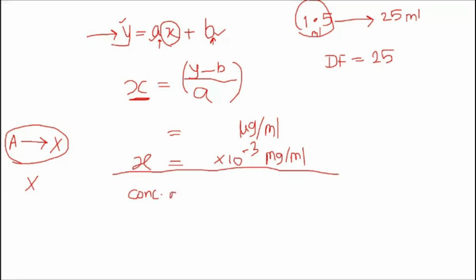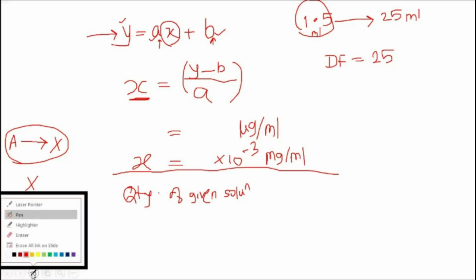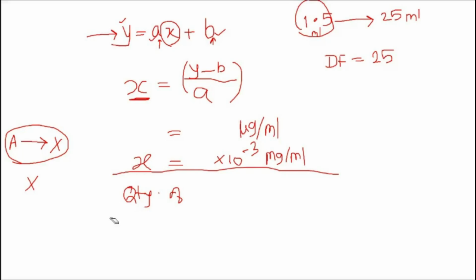So the concentration of the given quantity, I should write quantity of paracetamol in 1.5 ml sample solution, will be equal to x into the dilution factor of 25.